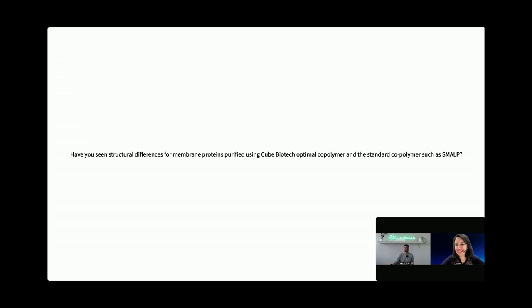Thanks, Philipp. No, I like your approach here. I want to continue on this topic of analytical characterization, because there are some questions related to that as well, again about confirming the results. How do you make sure the oligomeric state of the protein is correct? Are you using SEC-MALS? And what are the other functional studies that verify that the protein is active?